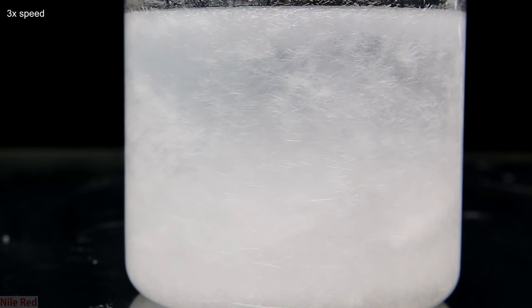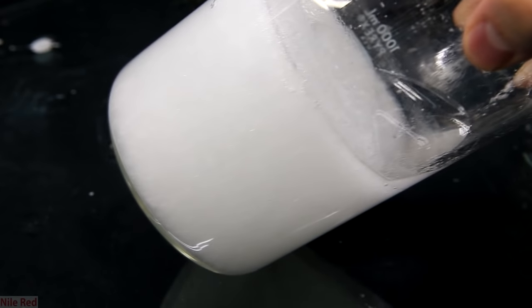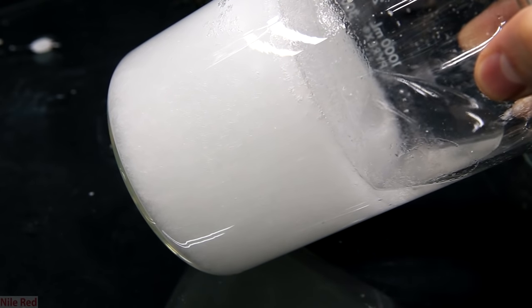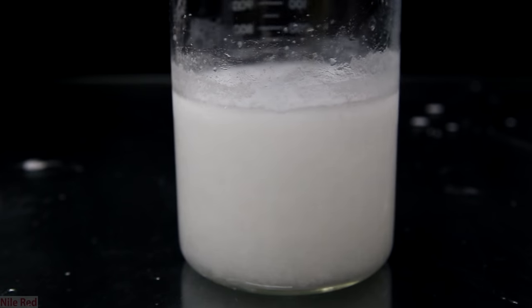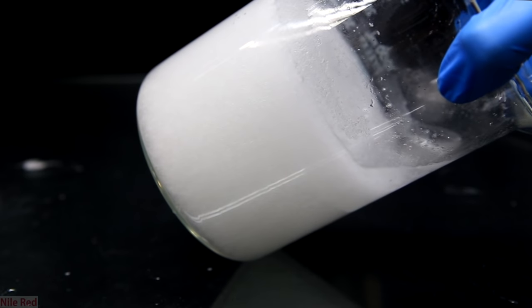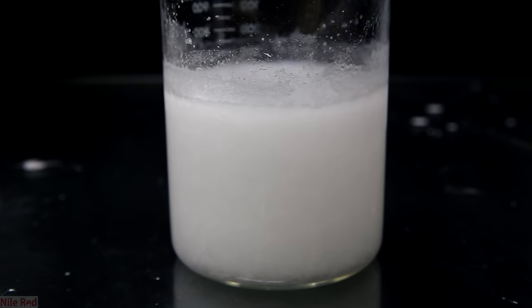Eventually, so many crystals had formed that it became completely white. After it had completely cooled down to room temperature, it had pretty much solidified. To further precipitate everything, it was placed in the freezer and now we have our completely recrystallized solution.